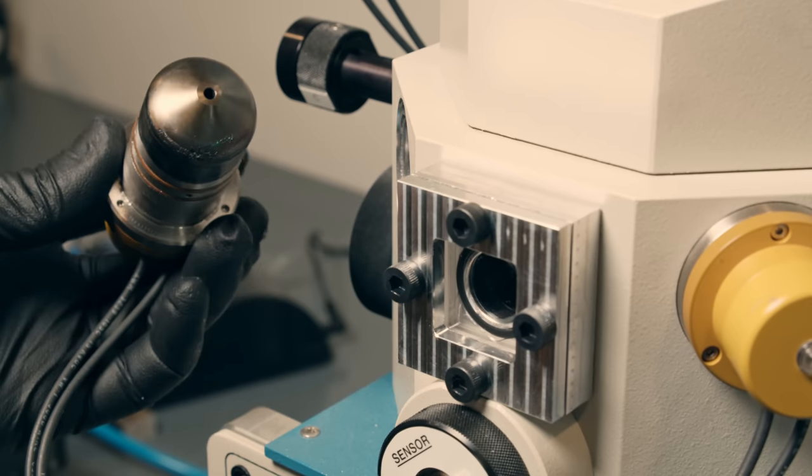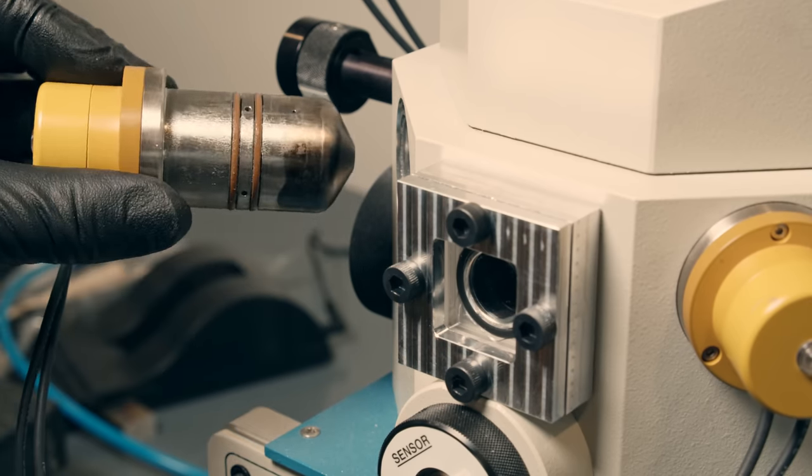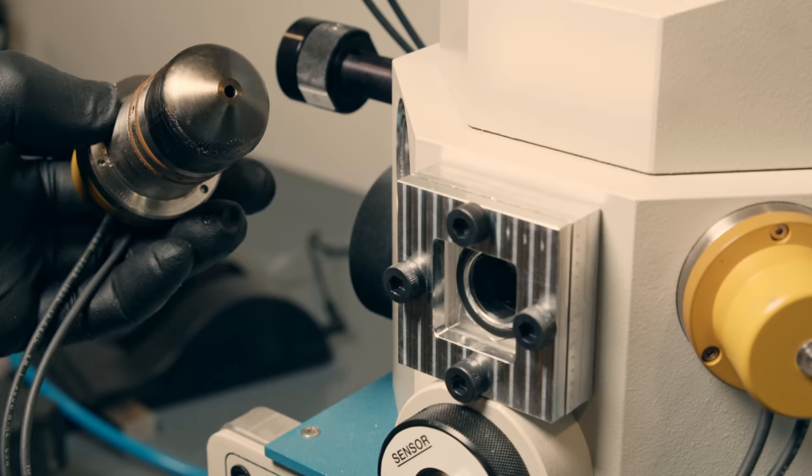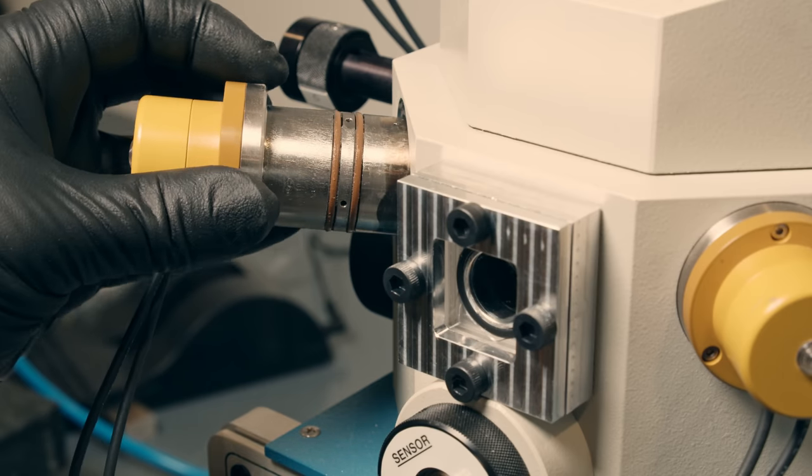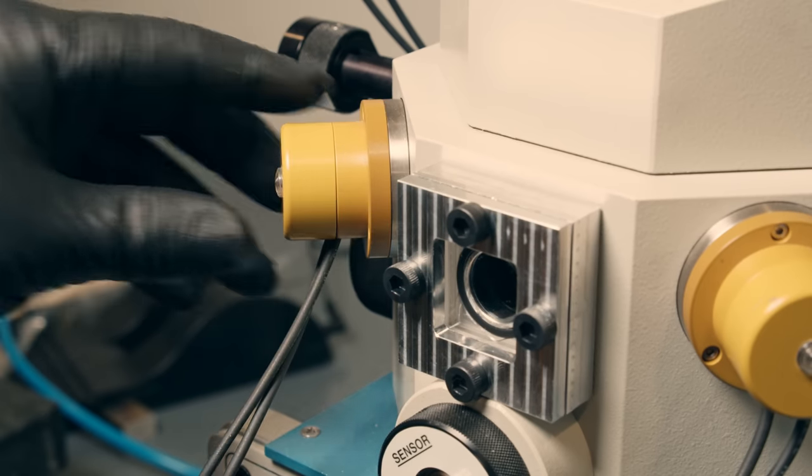Technically these guns are used for depositing material rather than etching, but they work the same as the etching gun, and it's just a lot easier to see. So all the footage will be showing those guns rather than the top ion gun.